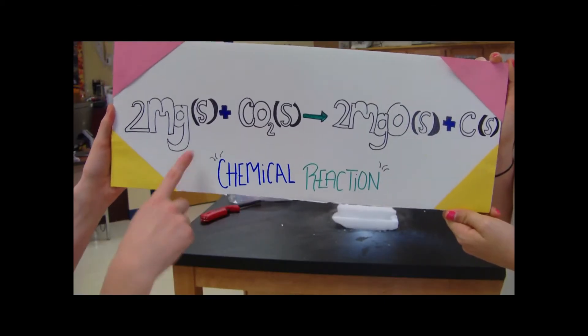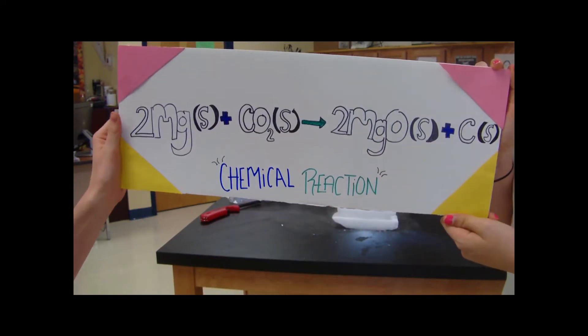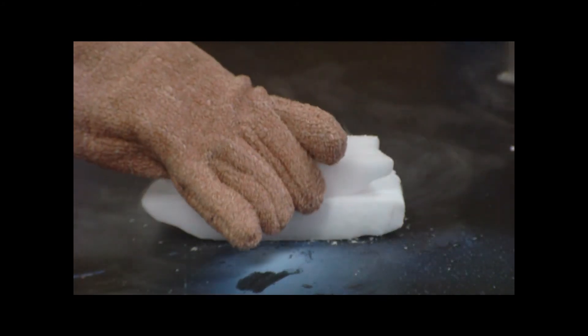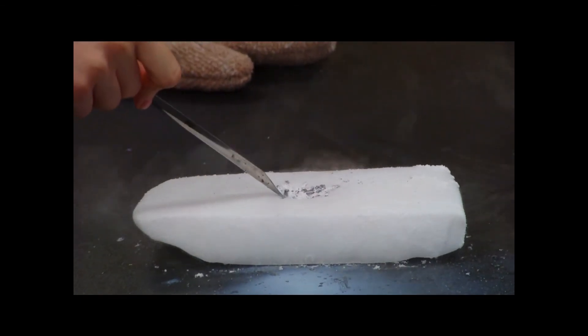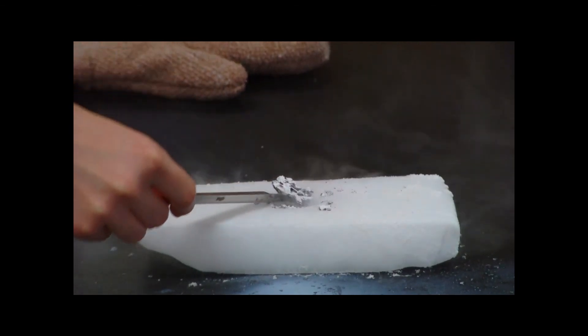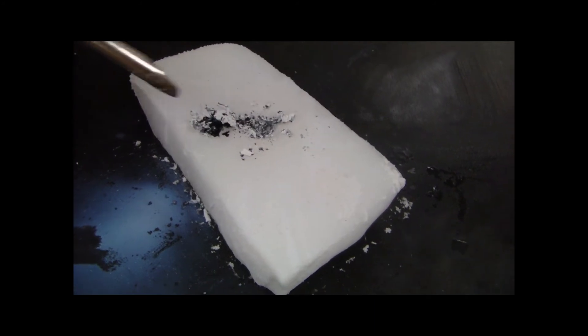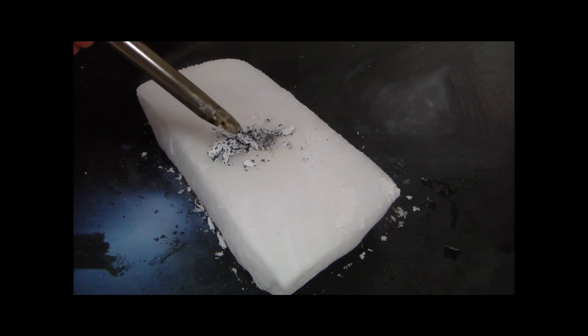Oh my gosh! The chemical reaction between magnesium and carbon dioxide gives off the product magnesium oxide and carbon. We are going to see the carbon inside the carved area of the dry ice.